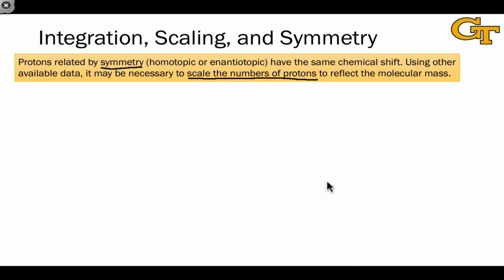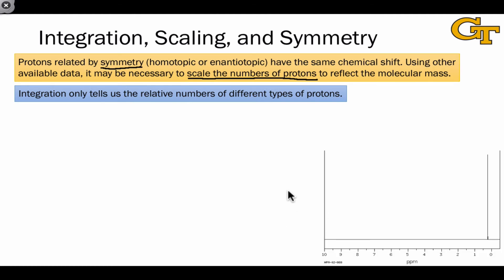Let me show you what I mean by this. The point really here is that integration only tells us the relative numbers of different types of protons. To get absolute numbers of protons, we need information about molecular mass. Here's a very simple NMR spectrum. And if you were to tell the computer that worked up this spectrum to calculate the integration for the single peak here, it would give something like this, and because this is the only peak in the spectrum, it's going to assign an integration value to this of 1.0. It doesn't know what else to do. This is the smallest integration, and so by convention, it's going to assign it 1.0.